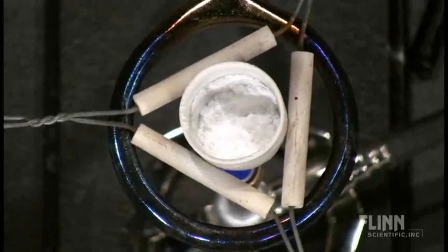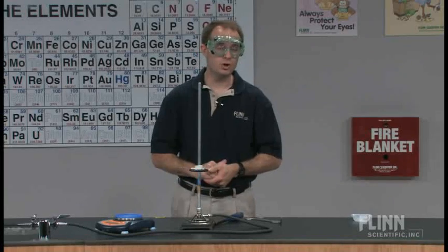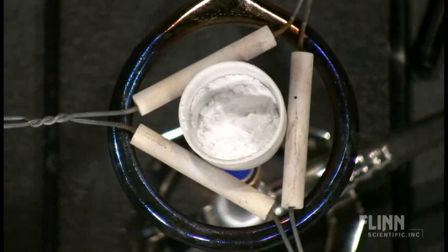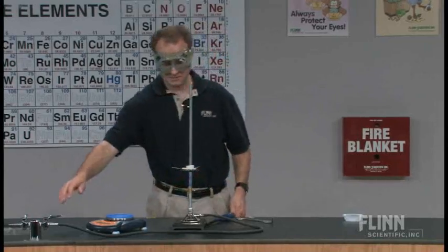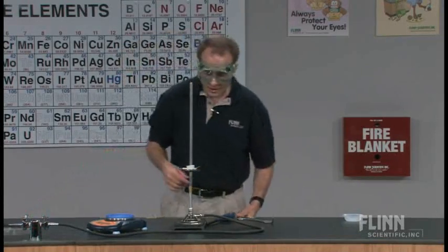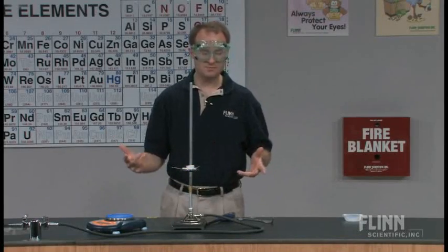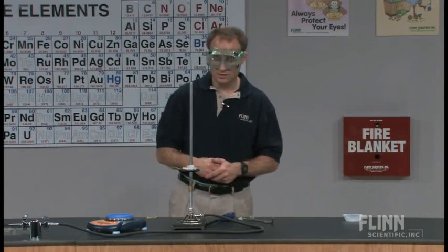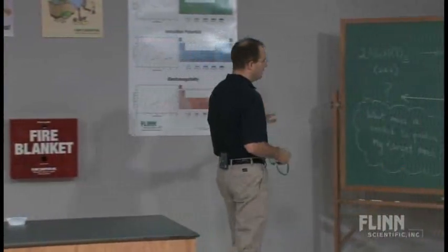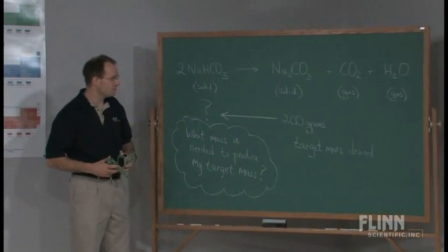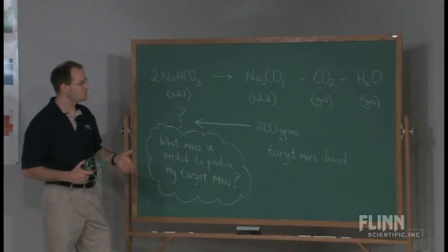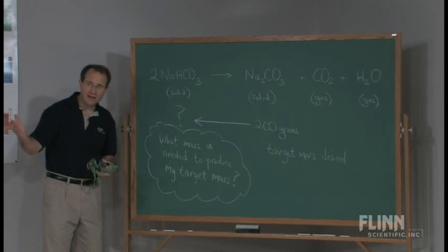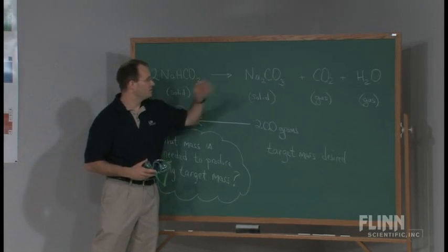We would let this continue to heat for several minutes. If you let it go for too long, side reactions can occur, but really that's it in terms of visual changes that you would expect to see during this chemical reaction. I'm going to go ahead and let this cool down. The two gases — carbon dioxide and water vapor — would be released into the classroom, so what would be left inside that crucible would be the solid sodium carbonate.